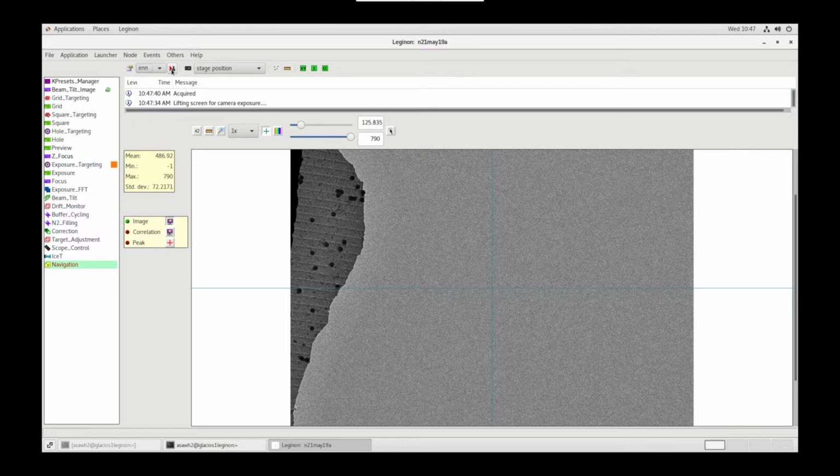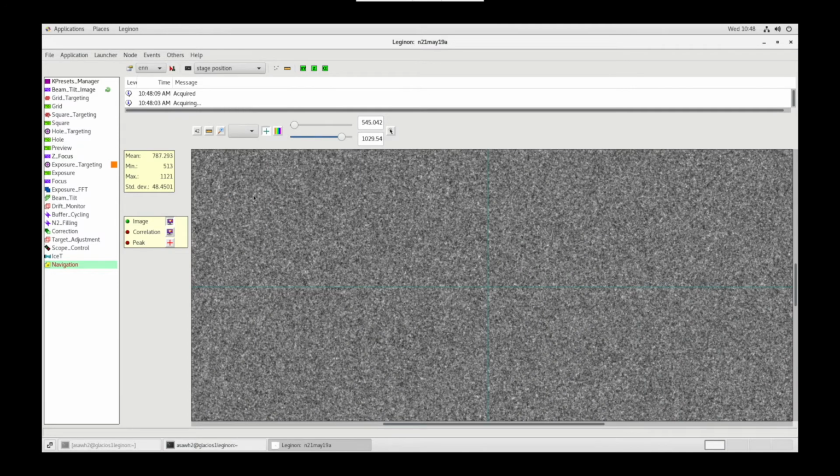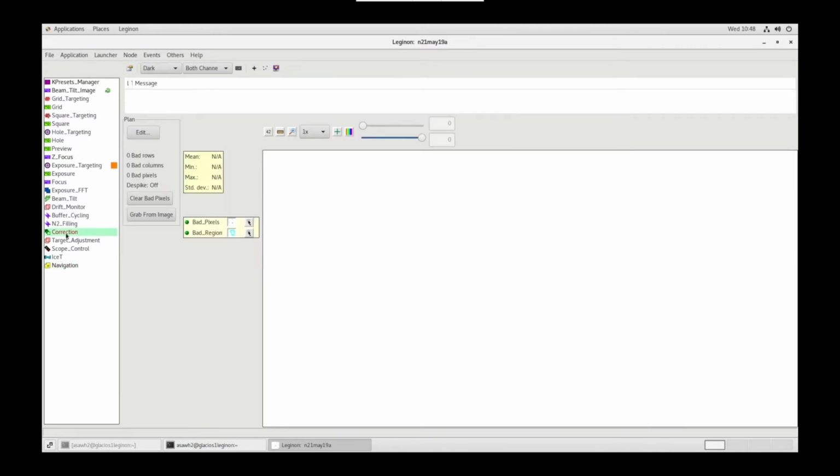Let's go to ENN, acquire. This is to confirm that we are indeed over vacuum. Now let's go to the correction node.